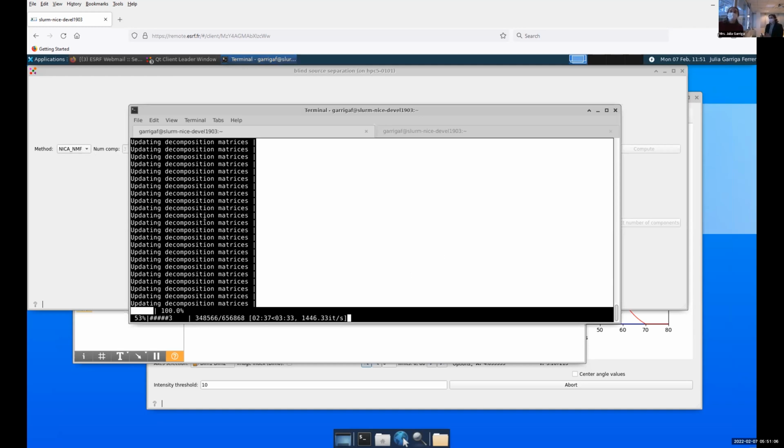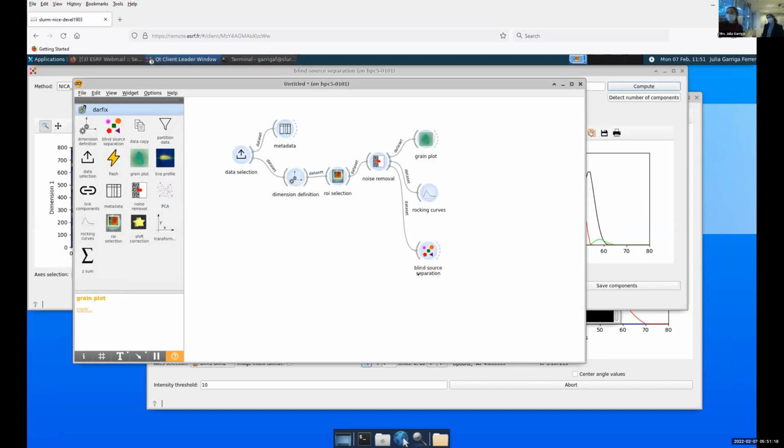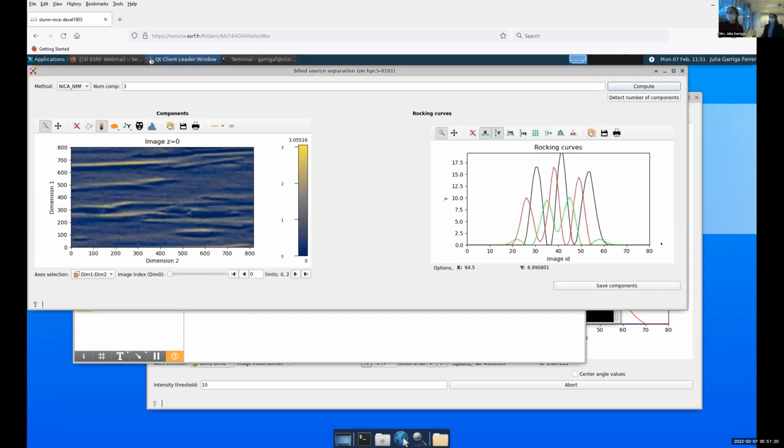Now while we leave it, I don't know how much time you have left in the working course, but maybe you have 2-3 minutes. So while this finishes computing, we can. Oh, okay, this is done.